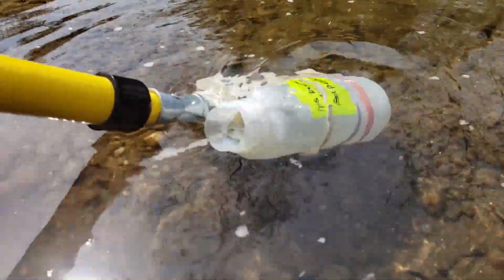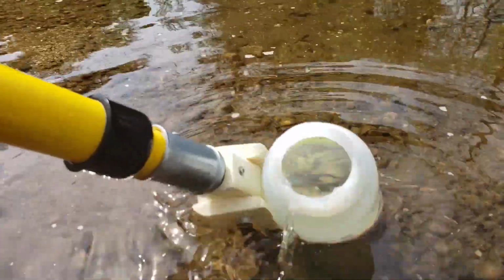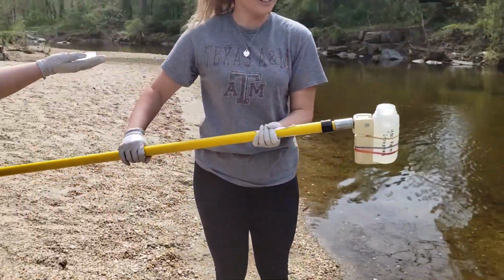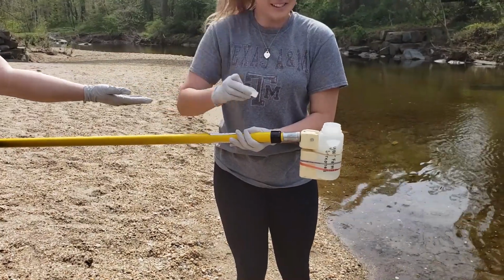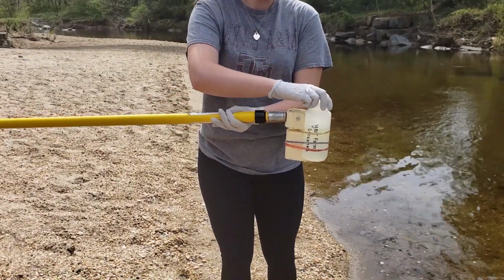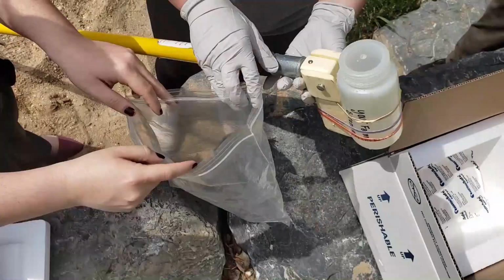Rapidly submerge the sample bottle as close to the irrigation intake as possible while avoiding collecting debris. If your bottle has a fill line, fill it to that mark. Otherwise, fill your sample bottle nearly to the top. Ensure the lid is secured on the bottle.